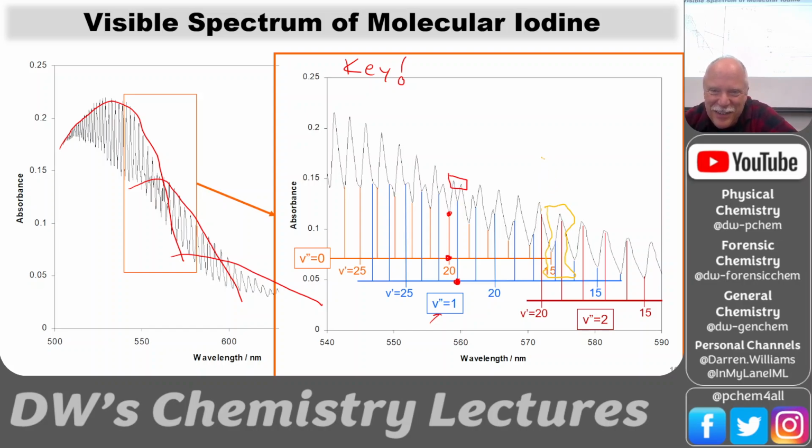Okay, so there's a little orange peak like this, tiny, and then let's do the blue one. Then there's a big blue peak right here, and then there's a red peak on top of that.